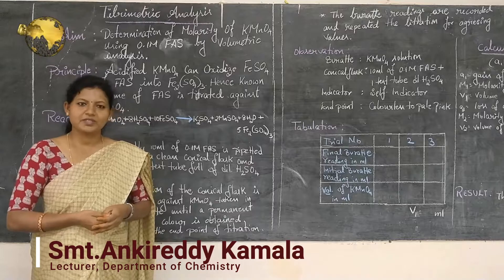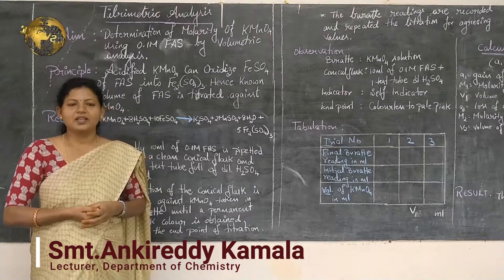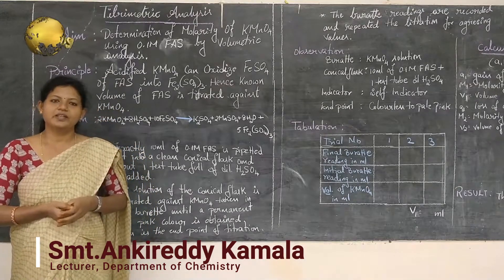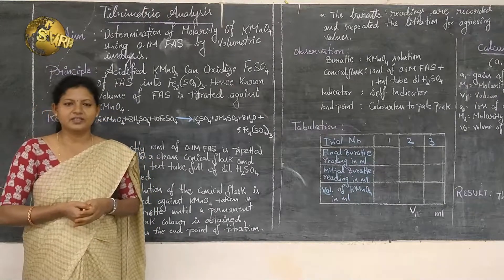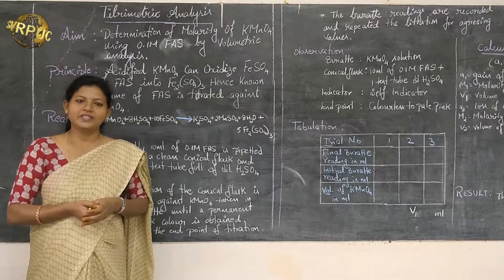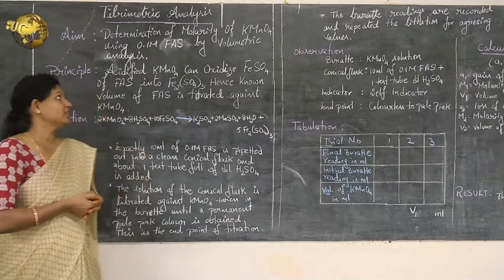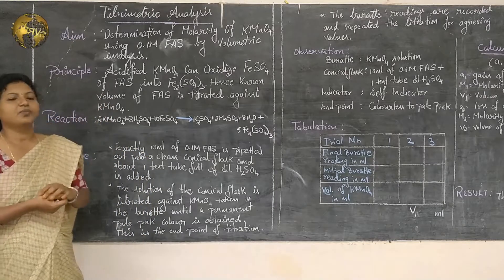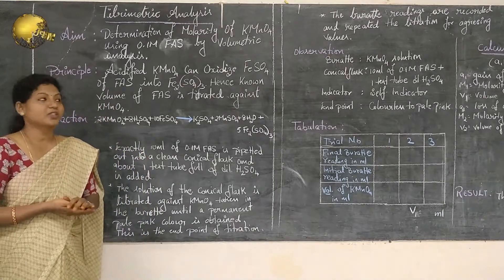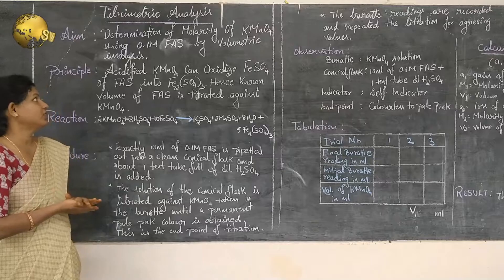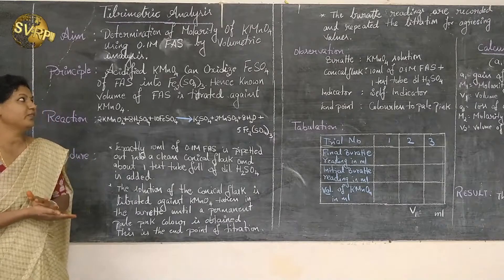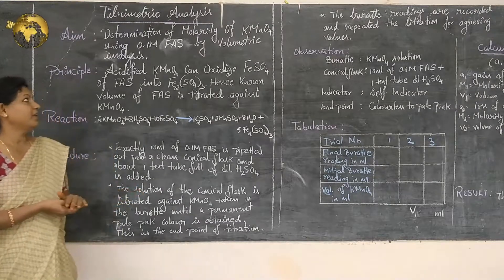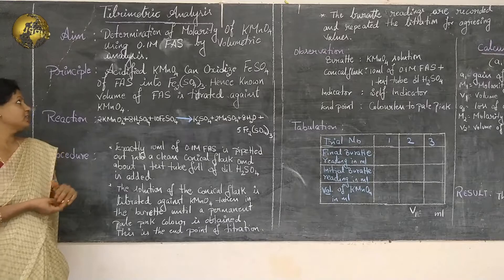Welcome to Siphon-Pasic Chemistry Factors. In this session I am showing to you volumetric analysis. Our experiment is the determination of the molarity of potassium permanganate using 0.1 molar ferrous ammonium sulphate by volumetric analysis.